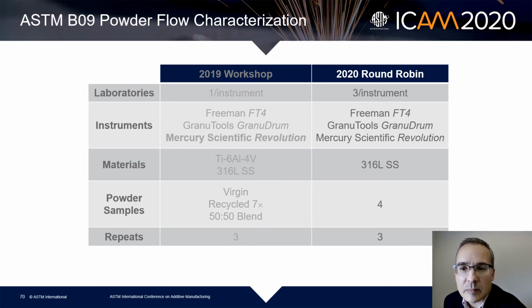Coming up soon, the 2020, this year yet, you should see the results of an ILS round robin, where now the same study has been expanded and 3 different laboratories looked at each instrument and 4 powder samples with repeats. So we'll see that probably before the end of the year.